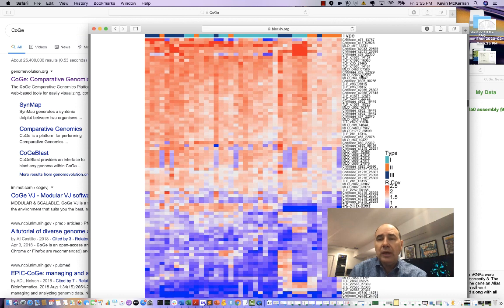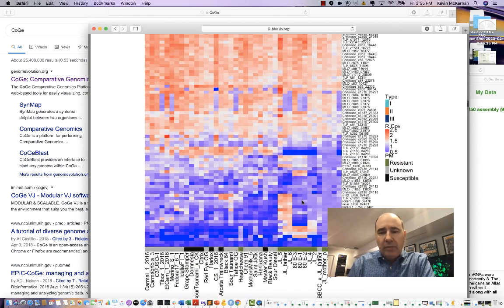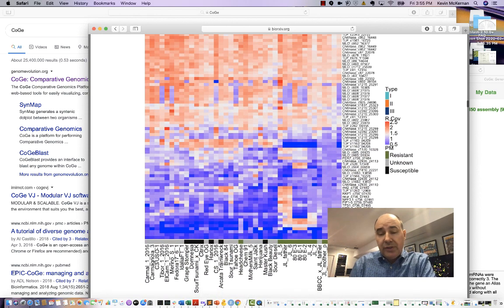The reason we're looking at chitinases and thaumatin-like proteins and MLO is that these are all the genes in hops that have been hunted down over the years to be involved in powdery mildew resistance. So we already have a few candidates in here, genes that we believe are involved in the powdery mildew resistance in Jamaican Lion, and we've cloned those and expressed them and demonstrated they actually destroy fungi.